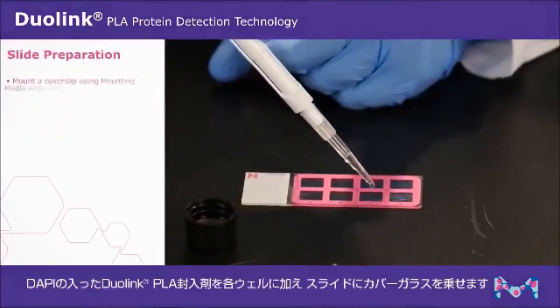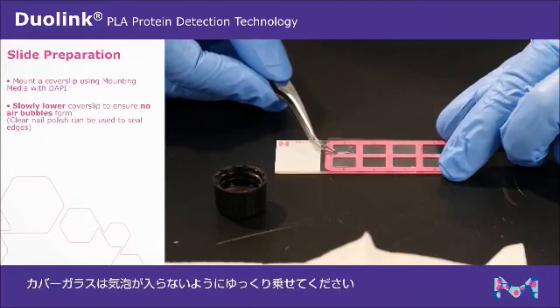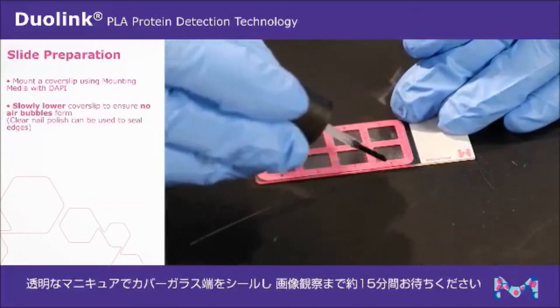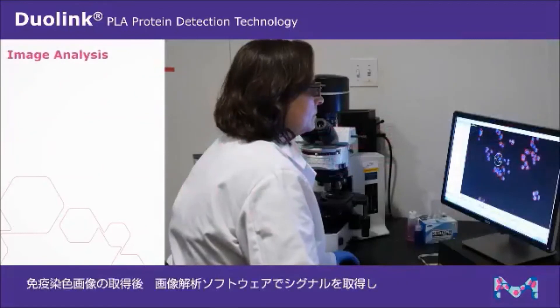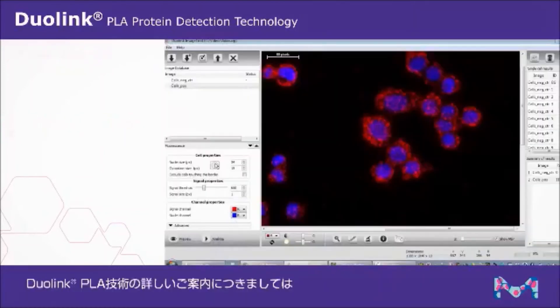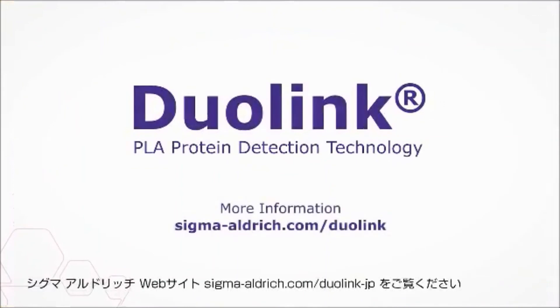To prepare your slide for imaging, mount a cover slip onto your slide using Duolink PLA mounting media with DAPI. Slowly lower the cover slip onto the slide to ensure no air bubbles form. Clear nail polish can be used to seal the edges; wait approximately 15 minutes before imaging. After capturing images, analyze results using the imaging software of your choice to obtain quantification of PLA signals. Always consult the user guides and technical support team for additional information on the Duolink PLA technology. For more information, visit sigmaaldrich.com/duolink.